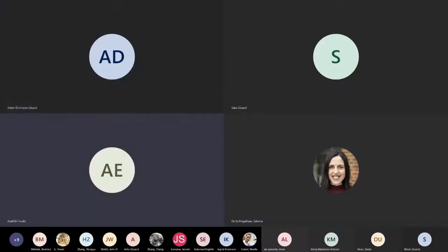Adam, great talk. It's nice to see something so complex as EM made simple. But how much of it do you think is basically getting a good grid preparation? Because garbage in, garbage out. So how can we use this MiniTEM system as a pre-screen for our grids, as a quality control before we actually go about trying to collect particle information, if that makes sense.